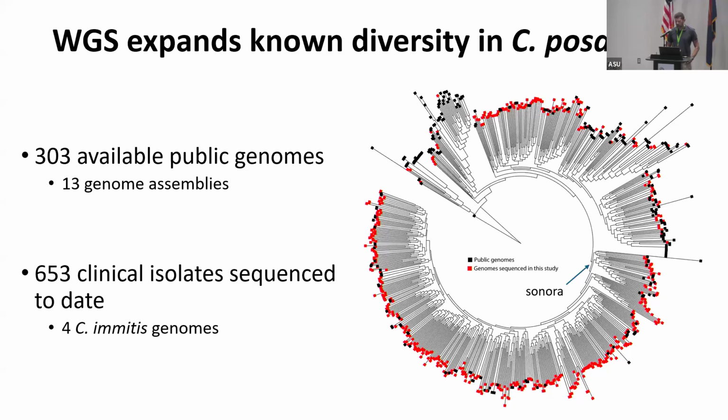And so the reason why this is a little unclear, we don't have the travel history behind all of these patients. We don't know if they acquired cocci from a different location and then presented here in Arizona for treatment. But all we know is we've really expanded this diversity and given us that framework to analyze new samples.